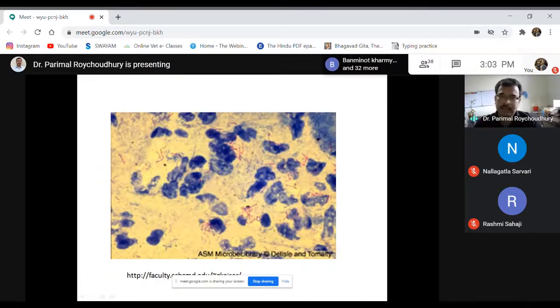And these are some smears, maybe from sputum. In the case of humans, when the tuberculosis nodule forms in the lung, it causes constant irritation, which leads to coughing, and sometimes this nodular lesion bursts inside the lung, and blood comes out through the mouth during coughing. So the saliva also carries a large number of these organisms, and if you can demonstrate the acid fast bacteria this way, these slides are diagnostically confirmatory in nature.